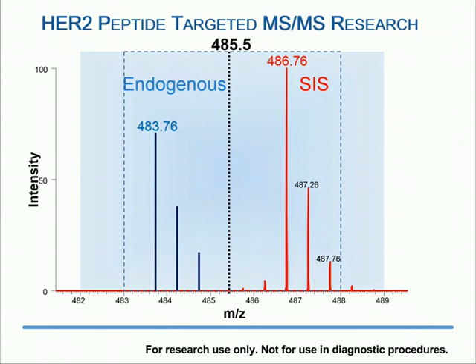I mean, using the same size window as the DIA at 5 would give you the first 3 isotopes of both the endogenous and the stable isotope labeled standard, which should be more than sufficient for the isotope ratio calculations and also effective quantification. You could even drop it down to a window of 4 and capture the first 2 isotopes of each, and this would actually get you fairly close to what we use for our DDA window, which is 2 units of mass to charge.